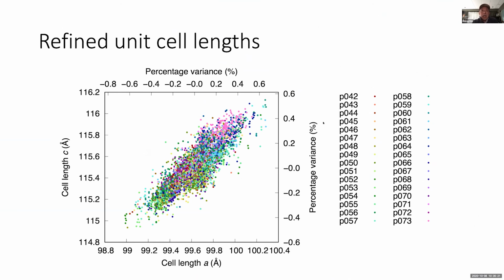So that's another statistic that shows there is potential non-isomorphism between so many crystals. If you collect data from many crystals, this is a potential problem you are going to run into. But we do not have hard evidence to show this non-isomorphism is already getting in the way and causing some damage yet. We are very cautious about this.